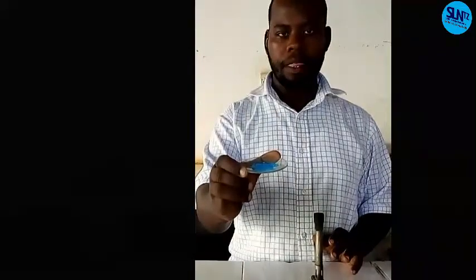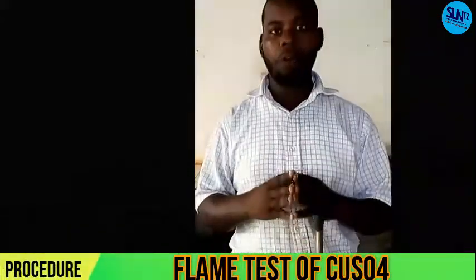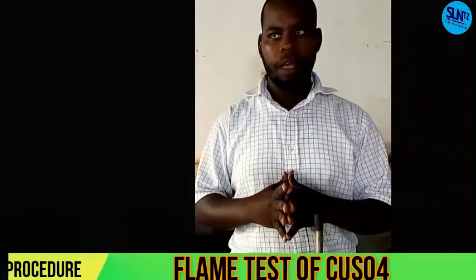We have started the qualitative analysis on appearance. We have started with the analysis of copper 2 sulphate. So that is the series number 3. We are going to teach you here. I'm going to show you the flame testing of our copper 2 sulphate. We have learned about the appearance.